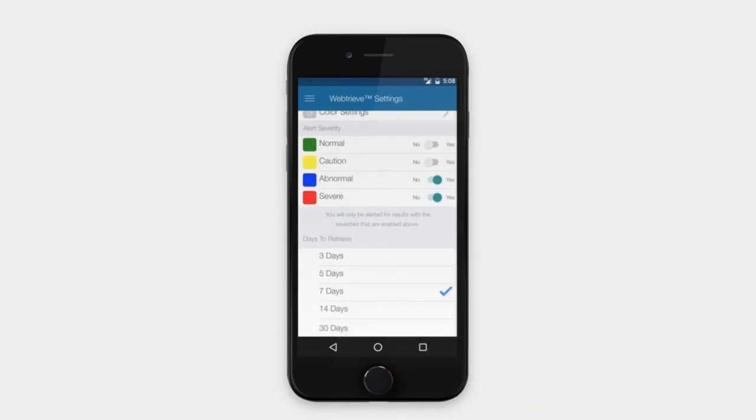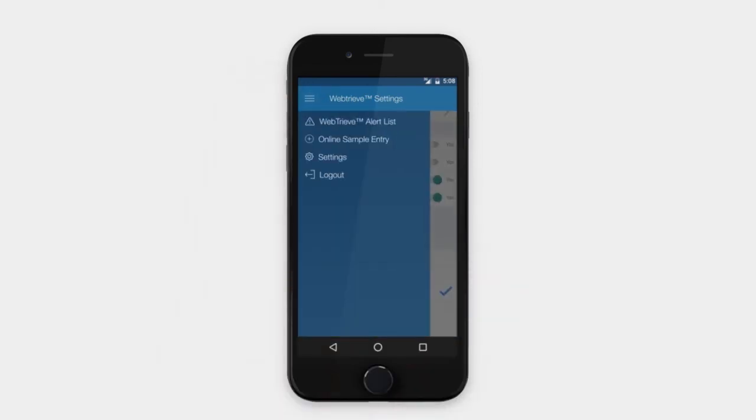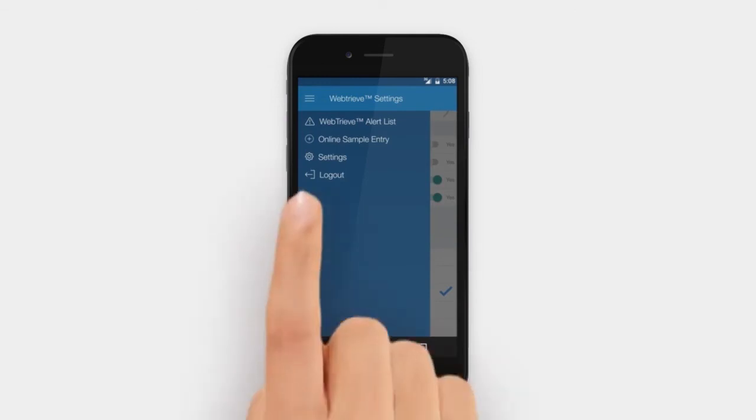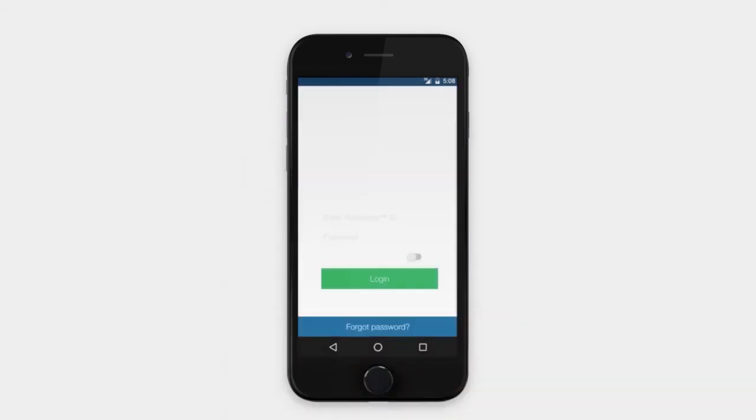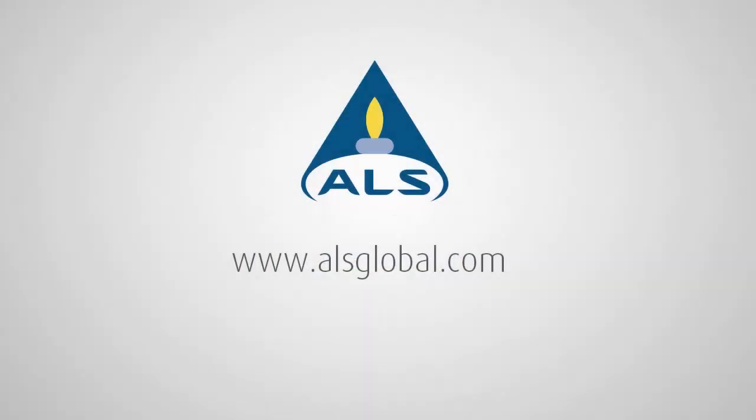You can establish fingerprint logon on supported iOS and Android devices. Devices with touch-based fingerprint readers are supported. Swipe-based readers are not supported.